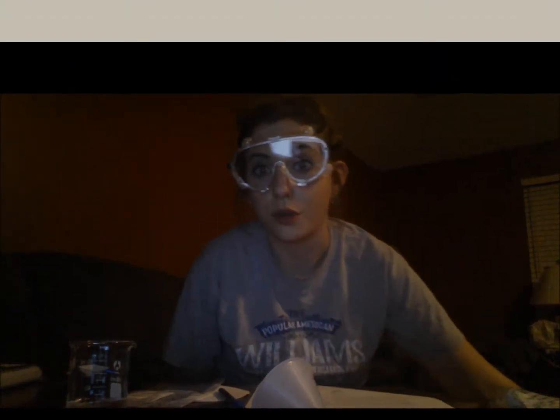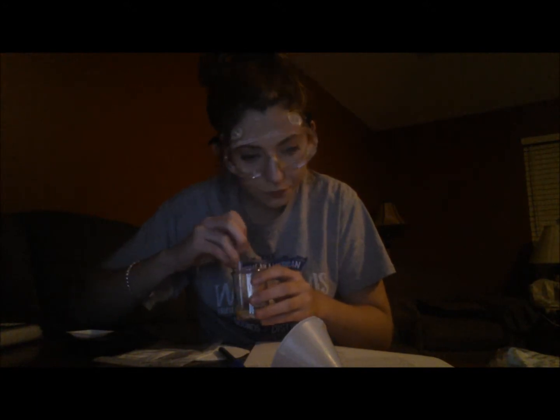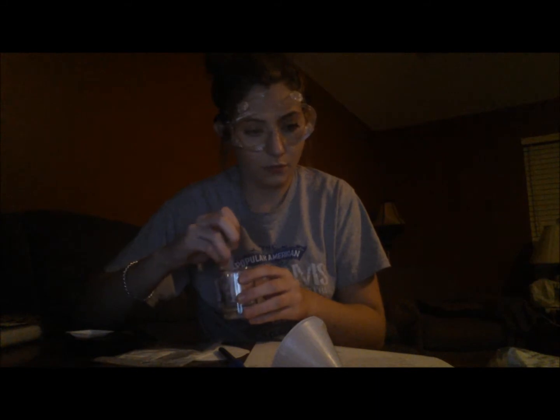We're going to put that in there, and stir. So I'm going to get my stir rod out. Okay, so we're going to mix. It looks like some of that actually hardened in the bottom there, so I'm going to break that up.